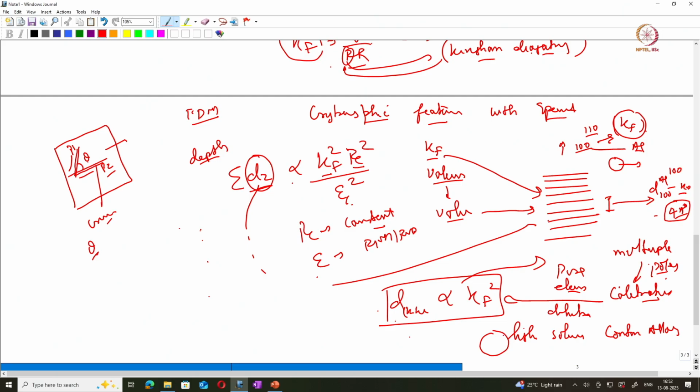So in those kinds of alloys, we use additional microscopic techniques such as TEM to first identify the crystallographic nature of those precipitates, and those features can be reused in the reconstruction, where we can calibrate the kf value based on the measured value in the reconstruction.